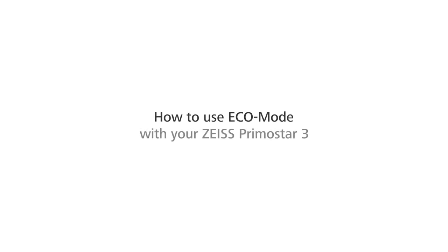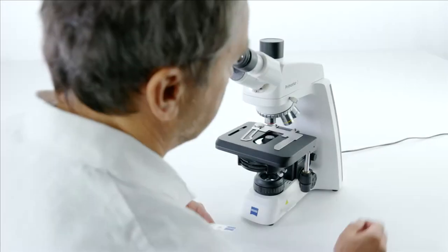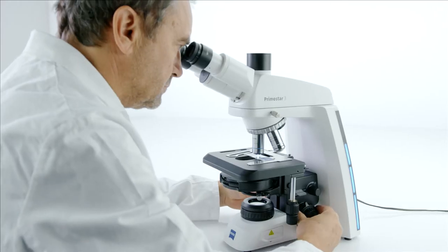How to use the Eco Mode with your Zeiss PrimoStar 3. There you are, totally focused on the work in your microscope.